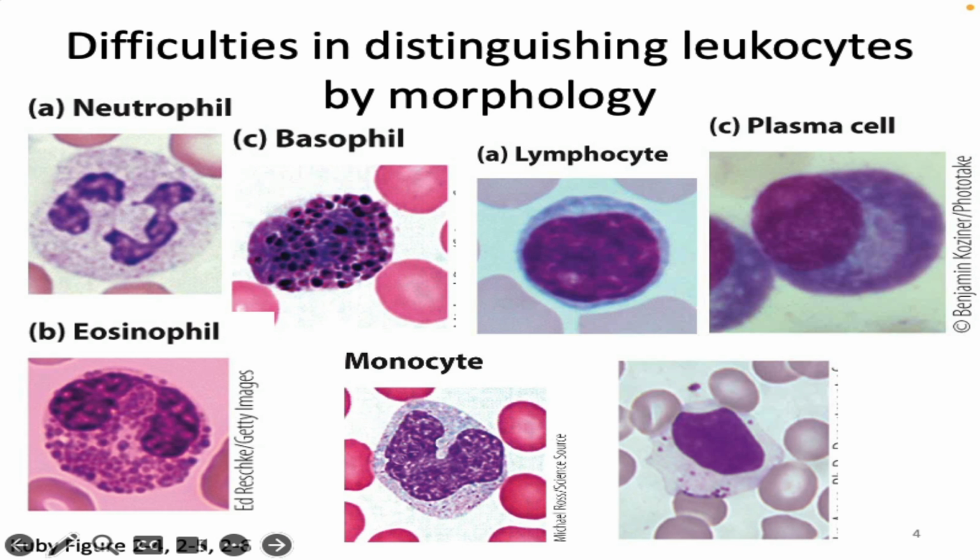This technique that I'm going to introduce you to today, when I was a graduate student, every experiment that I did had a minimum of 100,000 cells, and every experiment took a max of 2 minutes. So I was getting 100,000 cells in 2 minutes. No, that's just to put it in the machine. The prep took a little longer than that. But the machine would actually analyze 100,000 cells in 2 minutes. In fact, you can get it to go faster than that.